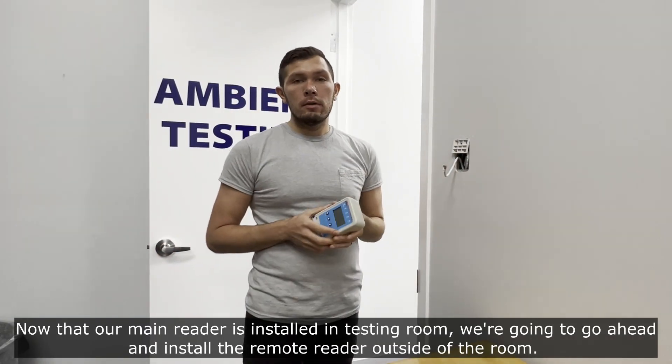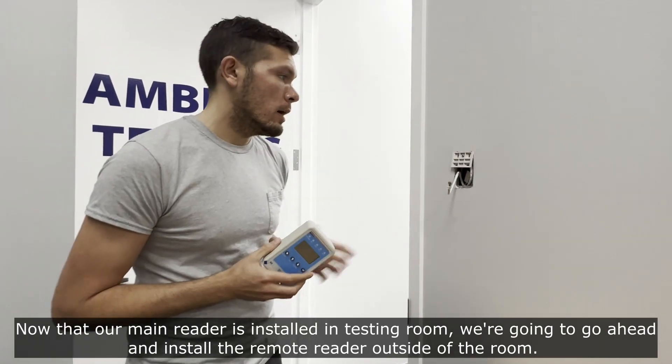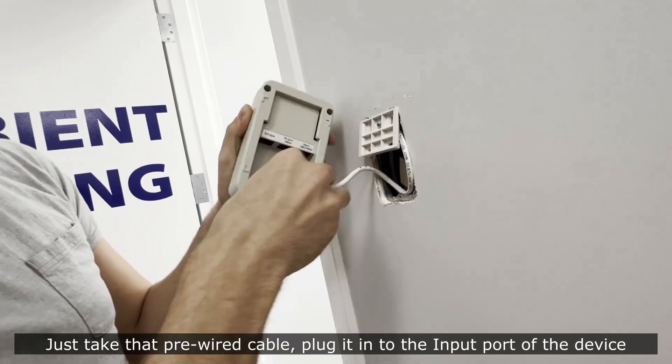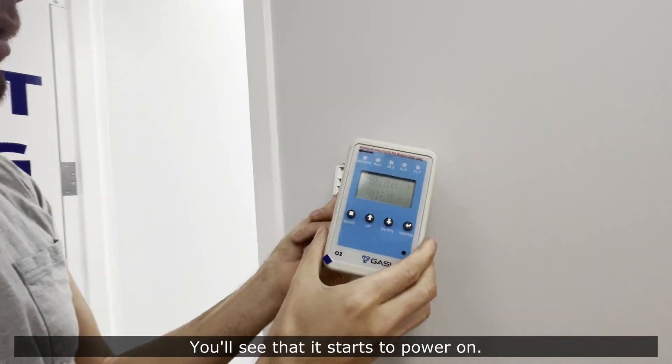Now that our main reader is installed in the testing room, we're going to go ahead and install the remote reader outside of the room. Just take that pre-wired cable, put it into the input port of the device, and you'll see that it starts to power on.